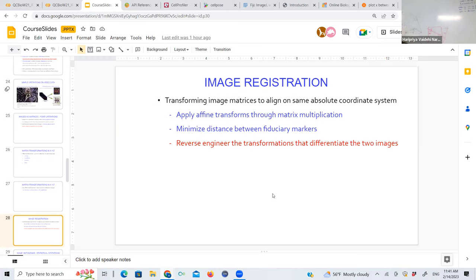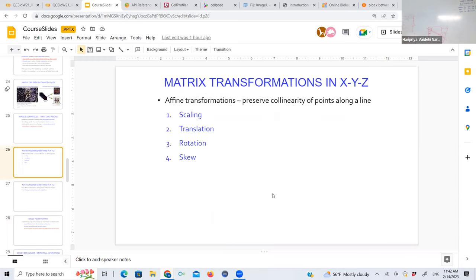The last thing that I just want to mention, we're not going to actually do this. It's called image registration. And the concept is very simple. Say I took one picture like this, which has some objects here. And then I took another image, which accidentally I took kind of like this. So this is what I get in the second image. I cut out this bit a little, and this comes further in. Now I want to take this image and match it to this somehow. So what do I have to do? First, I have to rotate it back a bit, and then I have to translate it and make it stitch. So I'm essentially doing a sequence of these affine transformations to match this image position to this image.